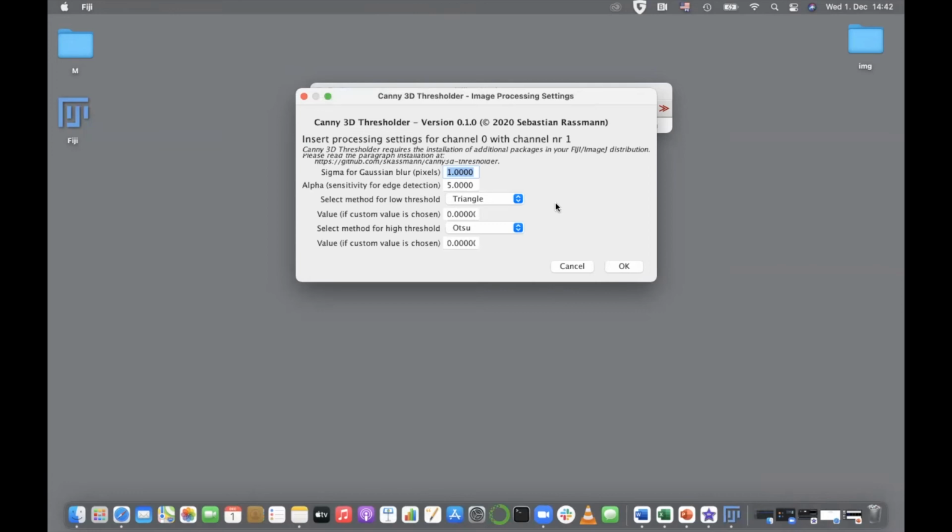This method performs an edge detection algorithm, and it is combined to a hysteresis threshold and a hole filling algorithm. Threshold parameters can be specified here. For this method, the image needs to be blurred with a Gaussian blur as indicated in the dialog to smooth the edge before performing edge detection. It is connected to a hysteresis threshold method.